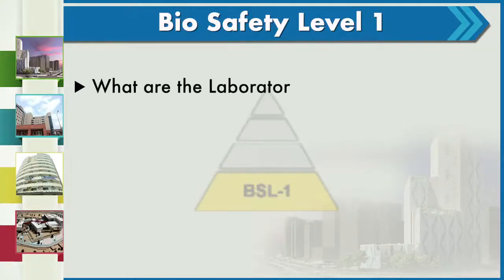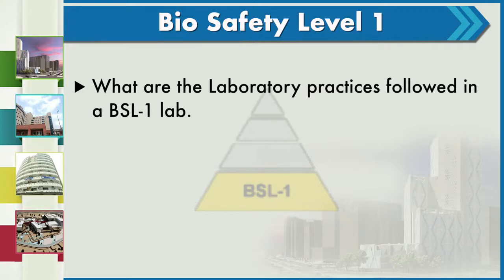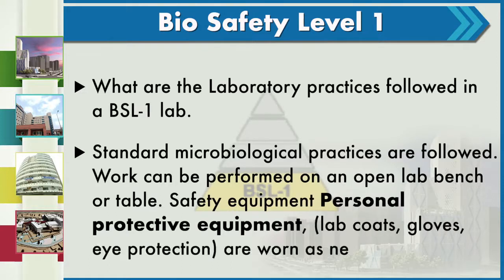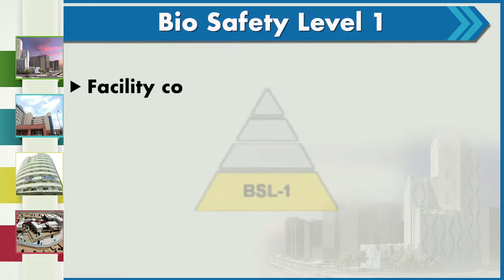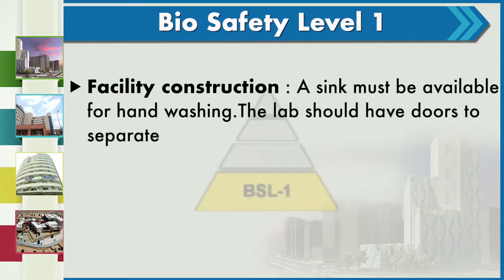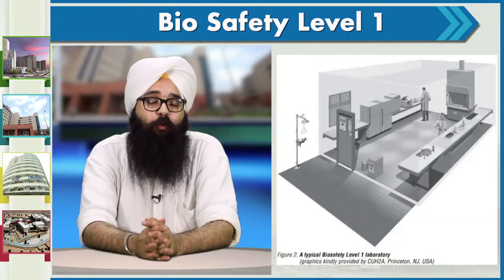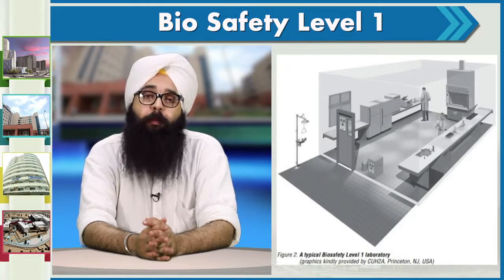In a BSL 1 lab, standard microbial practices are followed and work can be done on an open bench or table. Safety equipment such as personal protective equipment — lab coats, gloves, and eyewear — is still provided. For facility construction, a sink must be available for handwashing and the lab should have doors that separate the working area from the rest of the facility. We are going to share images of how a BSL 1 lab plan looks in the references.